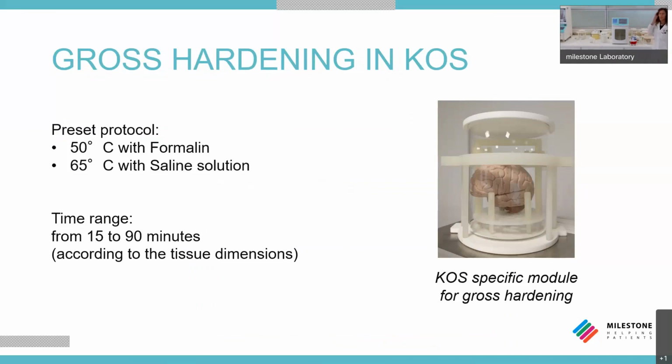In the hardening step, temperature control is fundamental, and the proteins are coagulated but not chemically altered. Microwave hardening in saline is a microwave stabilization. What is the advantage? After hardening, diffusion of fixative is facilitated, thus nucleoproteins are better retained, and staining is more concise with higher contrast.